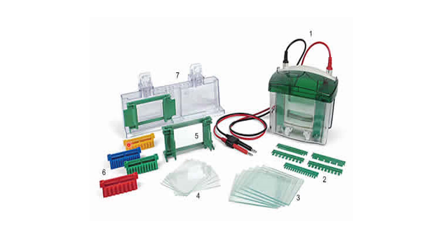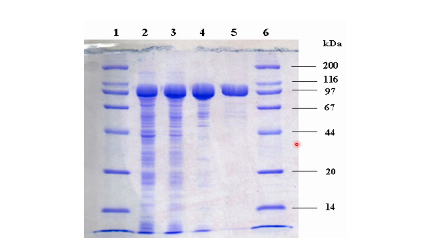There are several kinds of wells present over here: 10-well gels, 15 wells, 5 wells, depending on how many samples we want to run. Depending on that, we prepare the gels, load them, and then run the gel. After running the gel, we stain it. There are multiple ways to stain: we have the Coomassie blue stain, we have silver staining, sometimes fluorescent staining. We can use any of these.